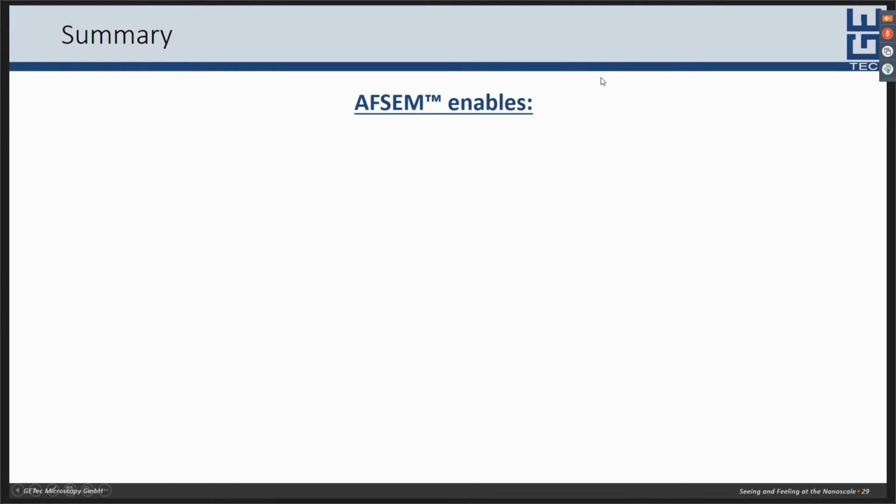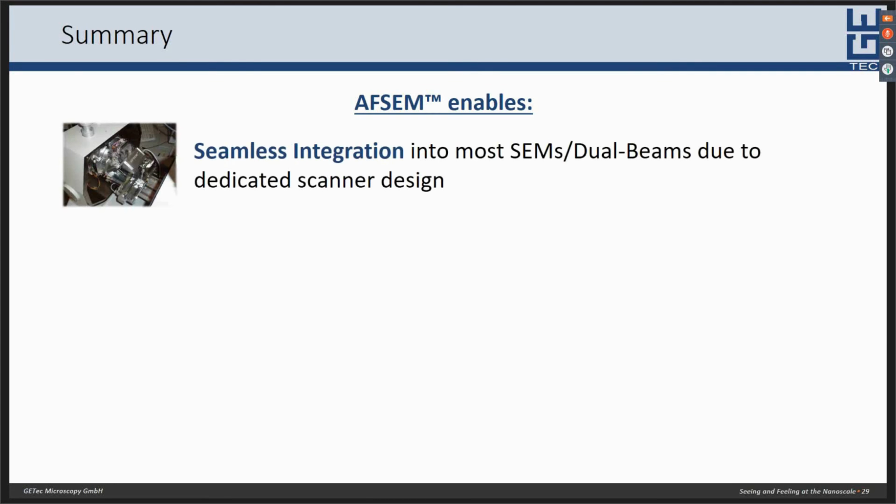Okay, I hope we could demonstrate to you in this webinar how the AFSEM can really change the way you can analyze your samples in a true correlative and interactive way without the need to move your sample. And the main features we showed to you today are that the AFSEM really enables a seamless integration into most SEM or dual beam systems due to our dedicated scanner design.